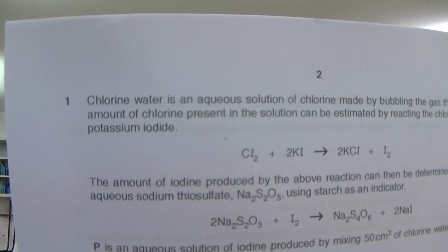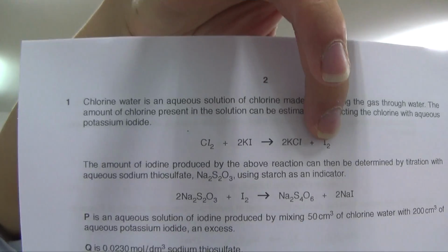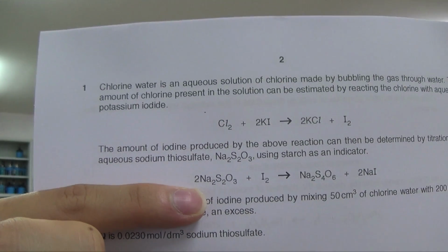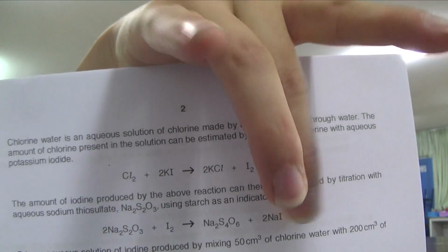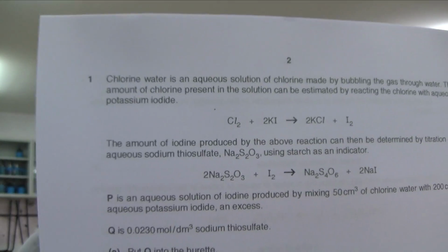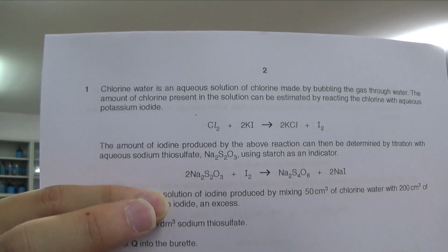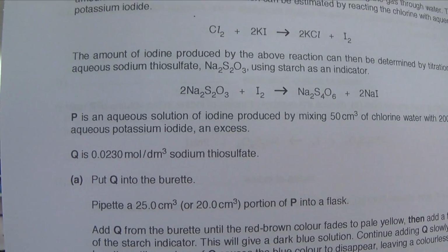I've got a printed paper here, although I'm not going to write on the paper. As you can see, you have a situation where chlorine reacts with KI, giving you the iodine. And our actual titration is the second one, which is sodium thiosulfate, Na2S2O3, plus the I2. The I2 gets reduced to I minus, and then we have our thiosulfate going to S4O6 2 minus. Not that the theory matters, but you do need the mole ratio and the balanced equation to do your calculations later on. So Q is sodium thiosulfate and P is your iodine solution.